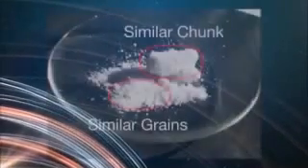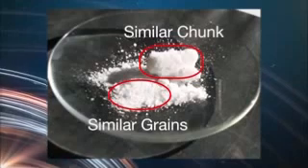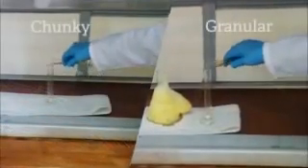In the first test, a compressed chunk of potassium iodide was used, giving a small surface area for the reaction to occur. For the second reaction, the potassium iodide was in powder form, with separate crystals, giving a large surface area for reaction with the hydrogen peroxide.